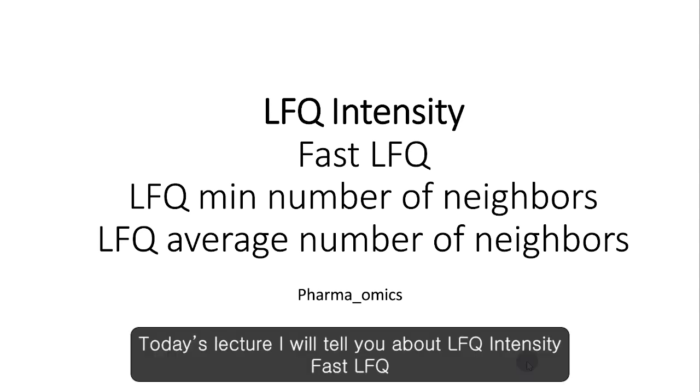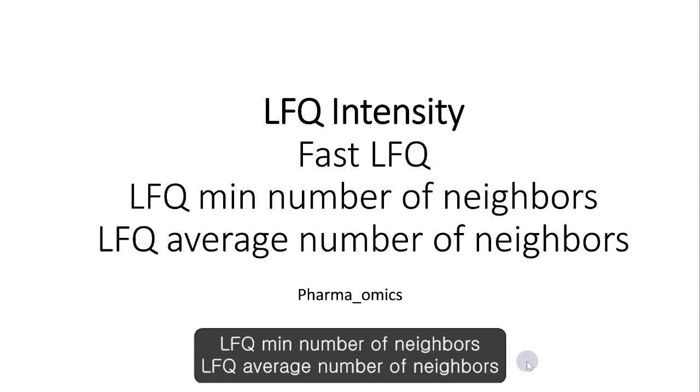Today's lecture I will tell you about LFQ intensity, fast LFQ, LFQ minimal number of neighbors, and LFQ average number of neighbors.